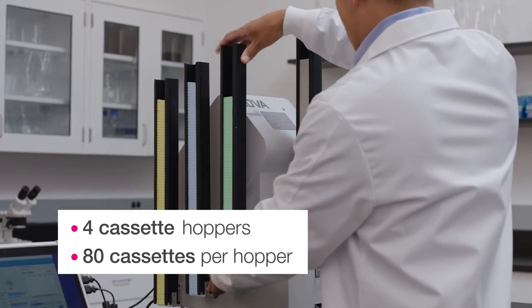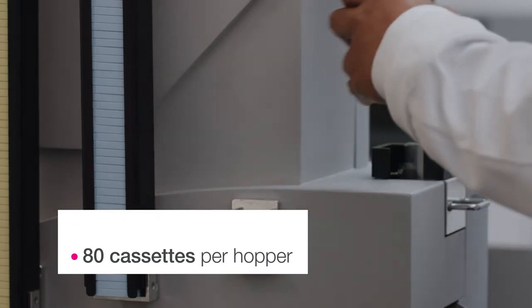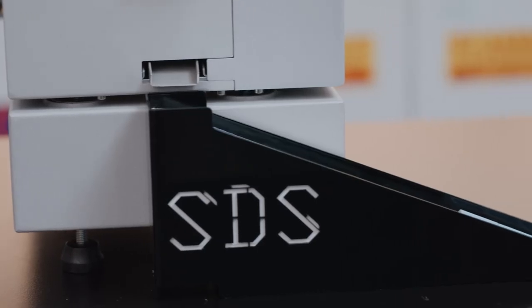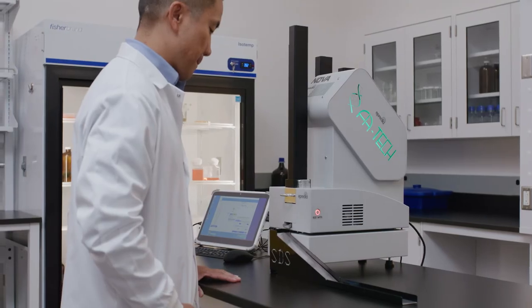The Nova offers four individual cassette hoppers that hold up to 80 cassettes each — that's 320 cassettes that can be manually exchanged when needed. The side delivery system can also be used to maximize laboratory bench space.